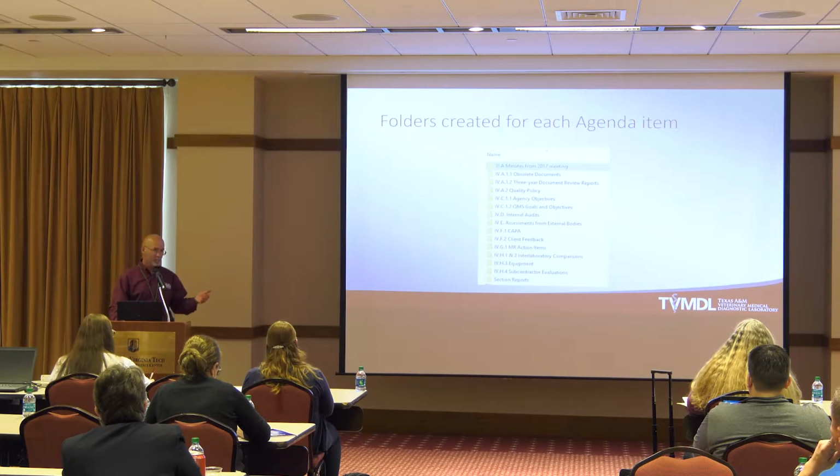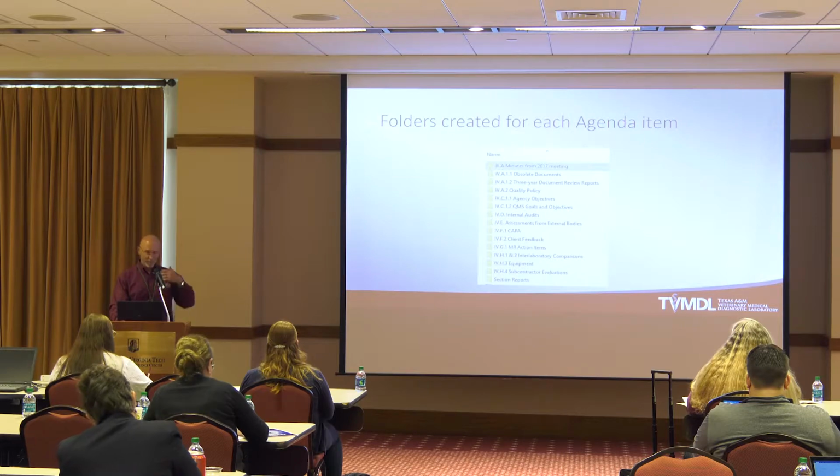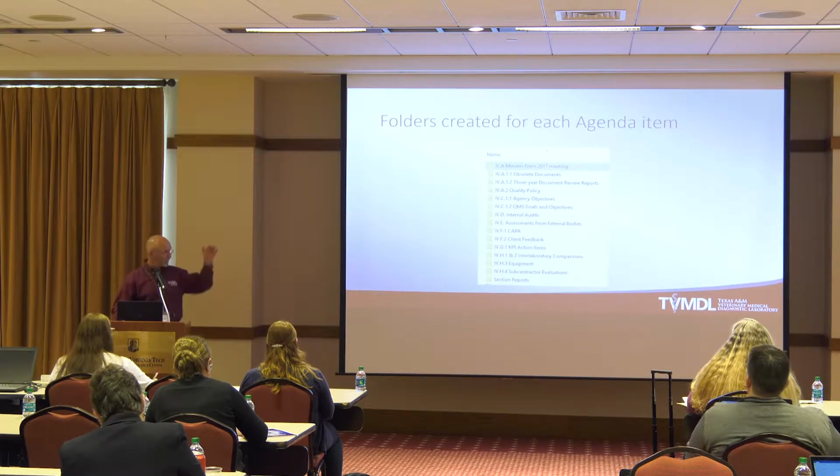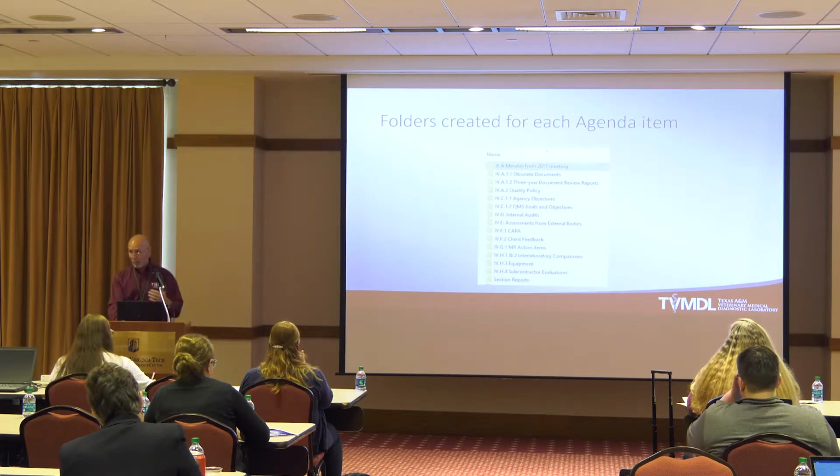So once we have it set up, then every time we have our management review, just go through and make the checklist and make sure everything goes into these folders so that when an outside auditor comes in, they can say, let me see your internal audits, and we can scroll right into here, and here they are. Everything is easy to find, easy to know where we're at, as opposed to just one big pool of stuff.